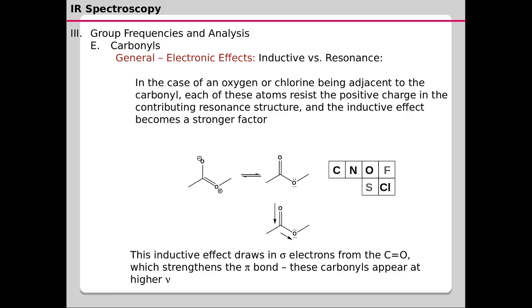Okay, as for carbonyl compounds containing an oxygen that is connected to the carbonyl carbon, such as the case of an ester, you should be able to see that if you look at the structure on the right hand side here.